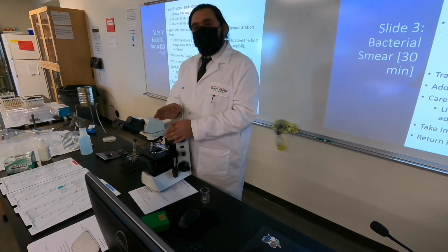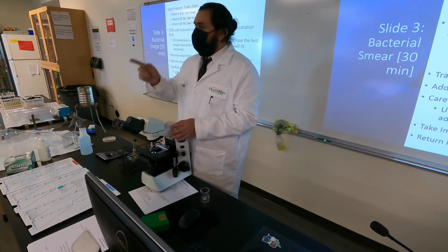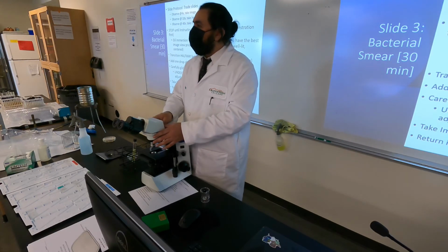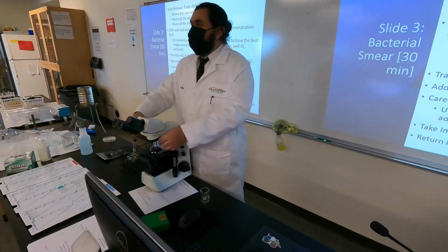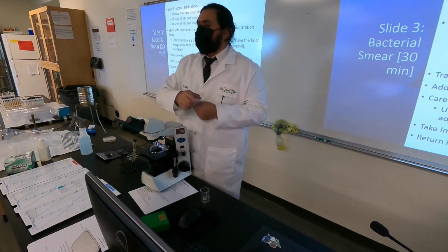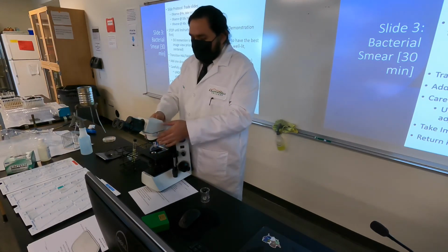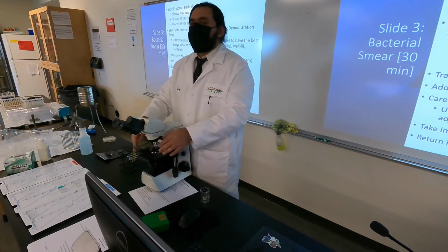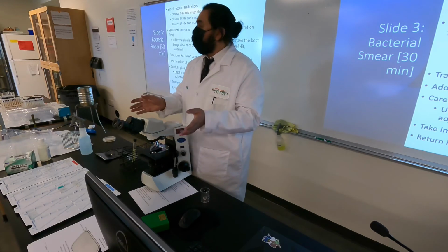However, let's make sure we know how to take it back down so we can close off. Once you're done, picture, or it didn't happen, you're gonna go in reverse. You're literally gonna go back to the inverted V, okay? And then take the slide out, because it has oil in it. And if you turn back to the other lenses, it'll start contaminating everything in a little daisy chain. So go back to the inverted V, take the slide out, and then you can start bringing that down your stage and reversing back everything without contamination.